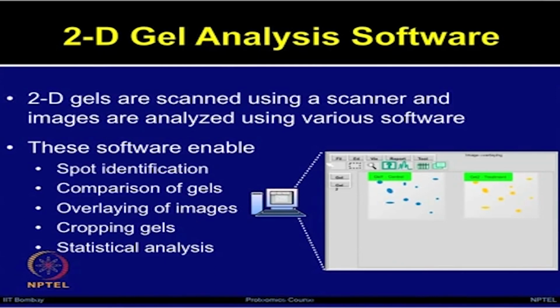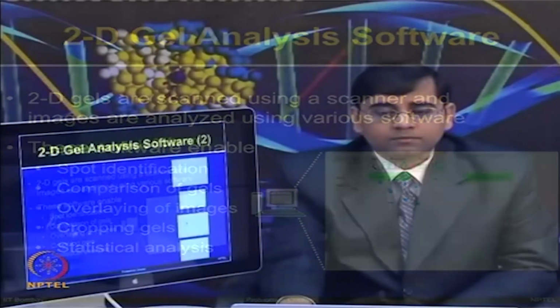All these software enable spot identification, comparison of the gels, overlaying of the images from your control and your treatment, cropping the gel, the part of which you want to compare, and further doing the statistical analysis.